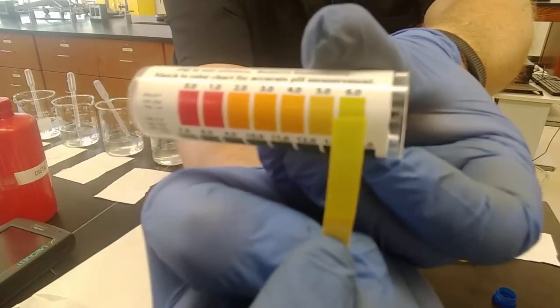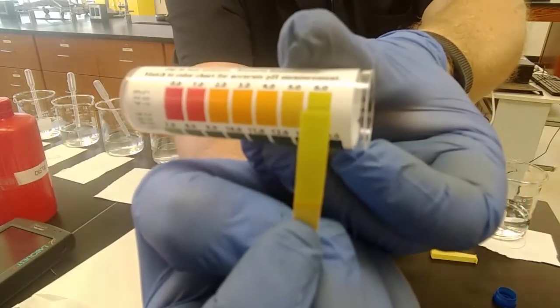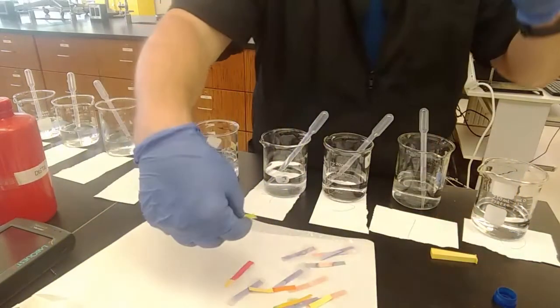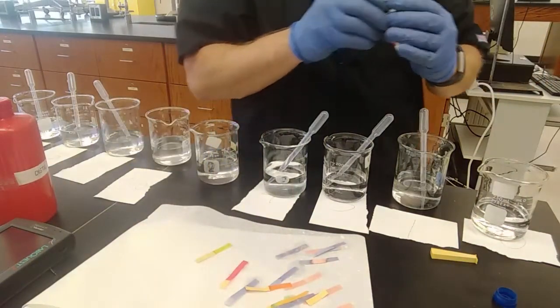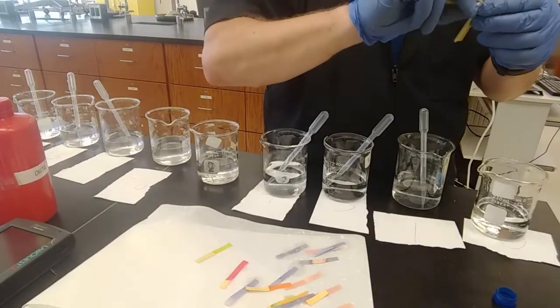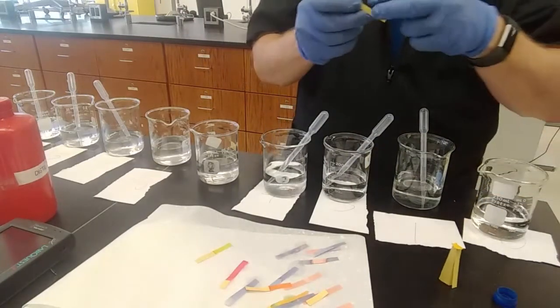Expecting a 4. The universal strip pH says a 6. It's this greenish color. I wonder what 7's going to say. Again, the meter might have been miscalibrated.